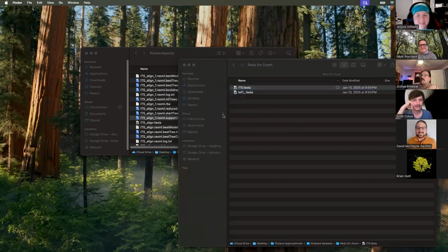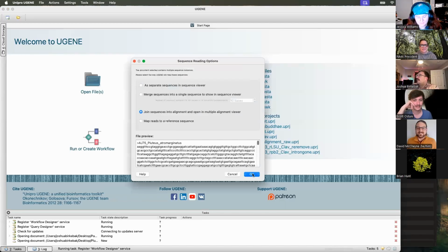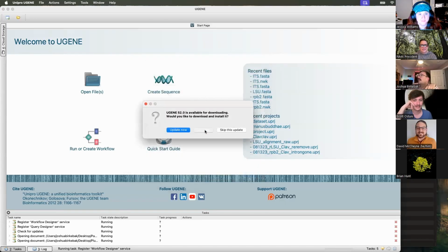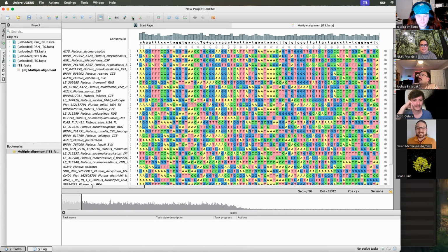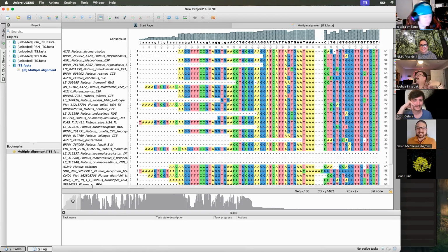Let's double check this. We're going to open up what should look like the real ITS now, and we'll make sure it looks like it should. Okay, now all of a sudden it came back to me. I was looking at it going, what happened? I realized I misnamed them.